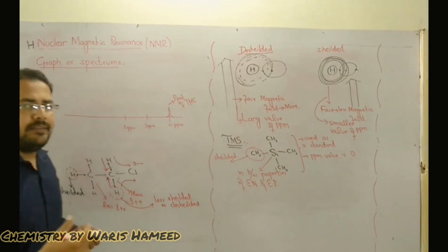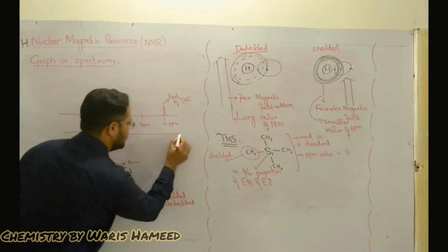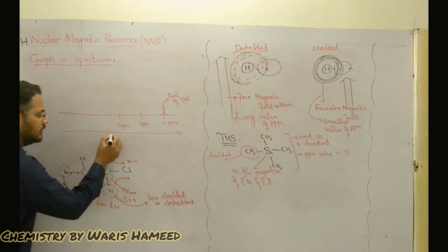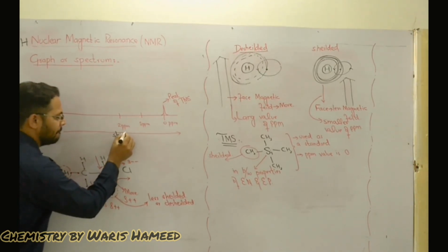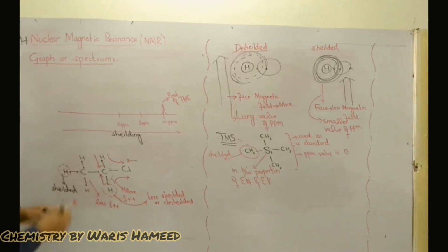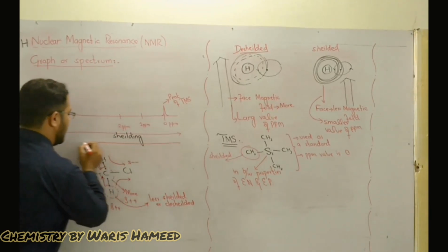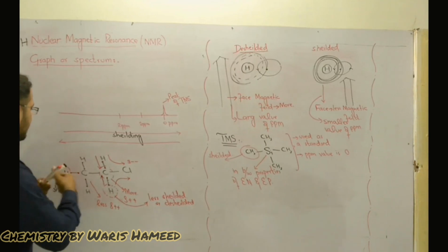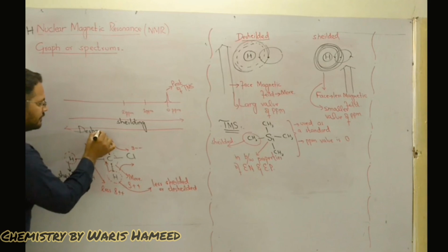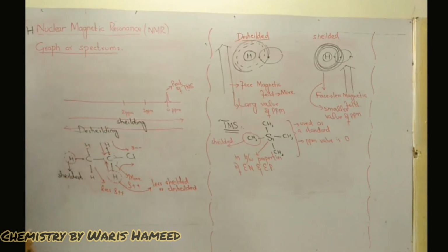So toward this side, we can write shielding, or shielded, and the reverse of it will be de-shielding.